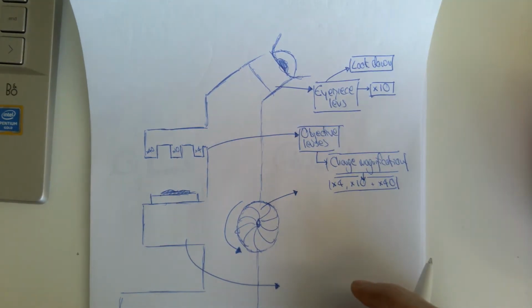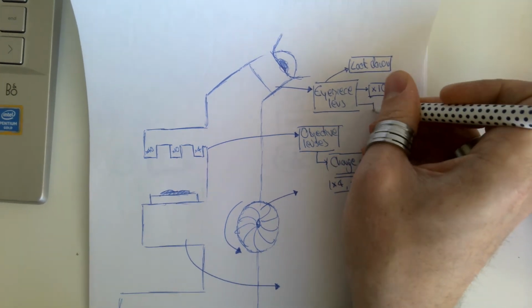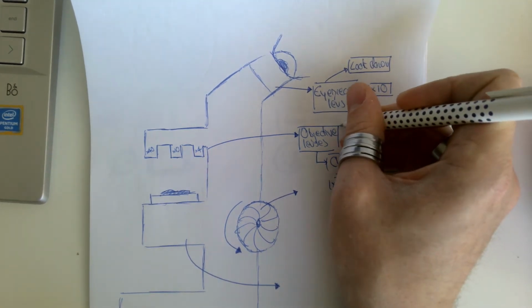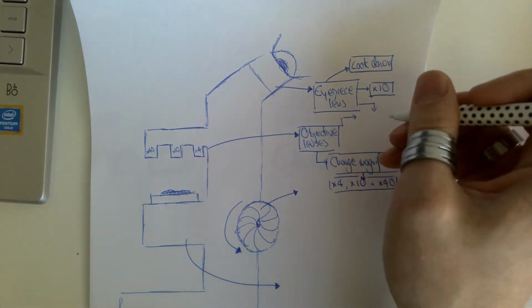Okay, now, the main thing to remember is that the lenses, both of them, make specimens appear larger.